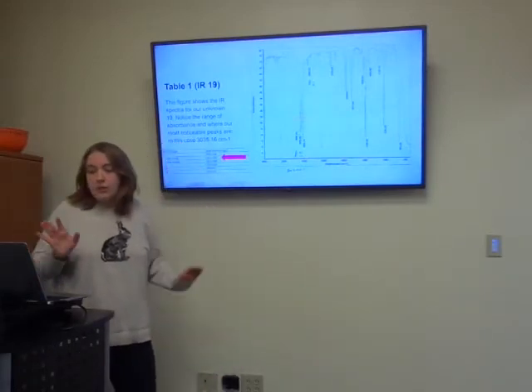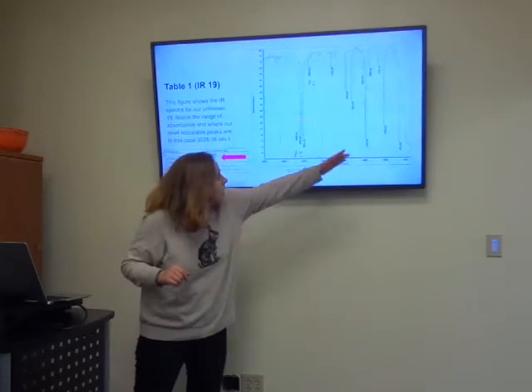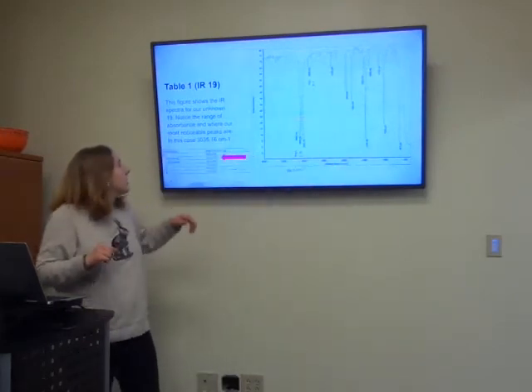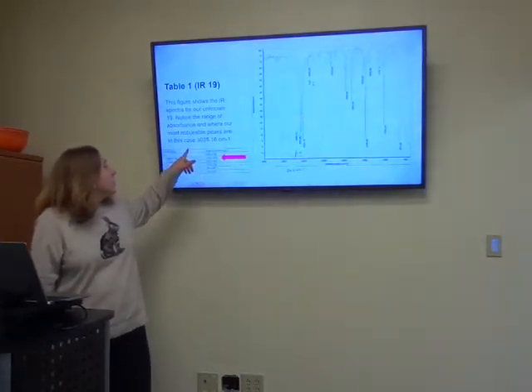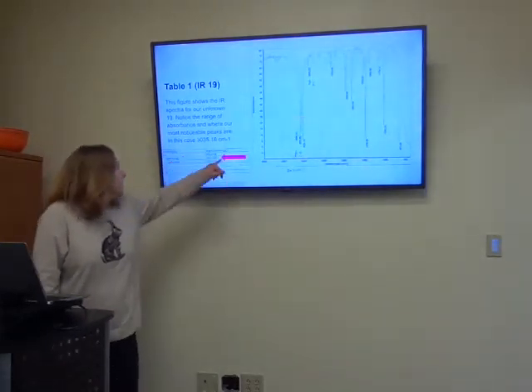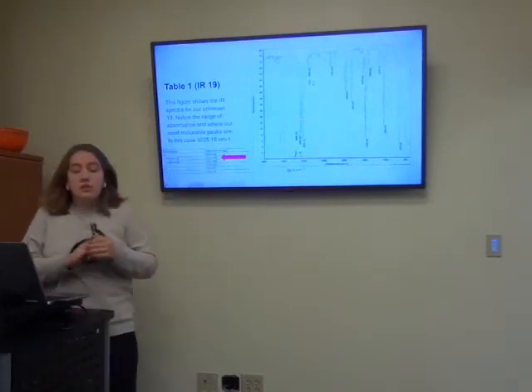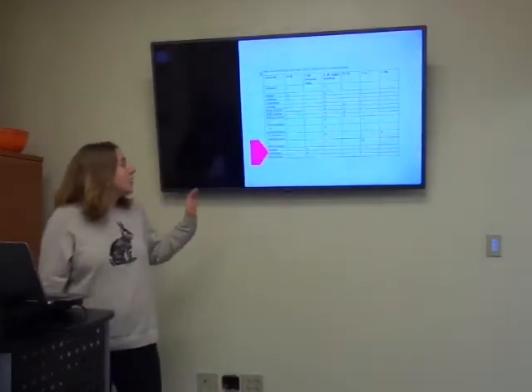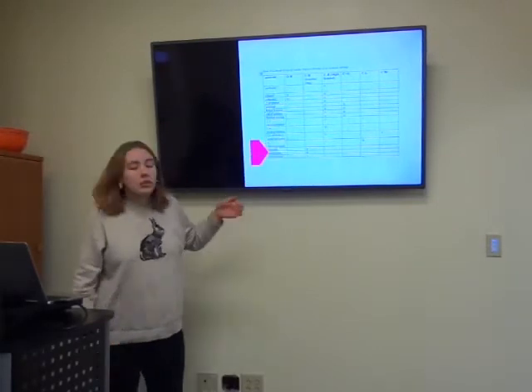So for our unknown 19, if you want to look here, you can see how it forms a lot of points. You want to look for the deepest point here, which is 3035.16, which falls quite nicely right here, showing that it is a carbon to hydrogen benzene ring. So again, looking back at our possible candidates, we have three that have a carbon to hydrogen benzene ring here.